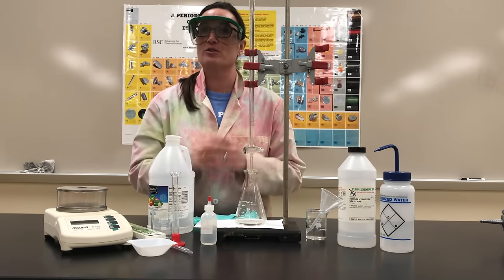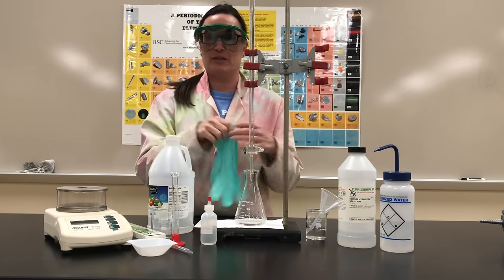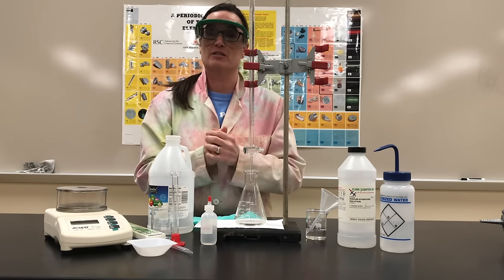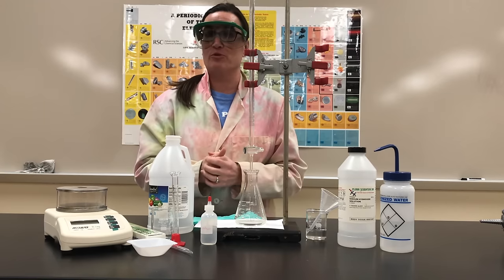Safety is super important, so make sure that you have your hair pulled back and you have goggles on. If you're required to wear gloves, put those on at this point before you start. If you don't wear gloves, make sure that if you get an acid or a base on your skin, you go wash it in the sink with copious amounts of water. Last, make sure that if you have jewelry or anything that's dangling, that it's removed before you get started.